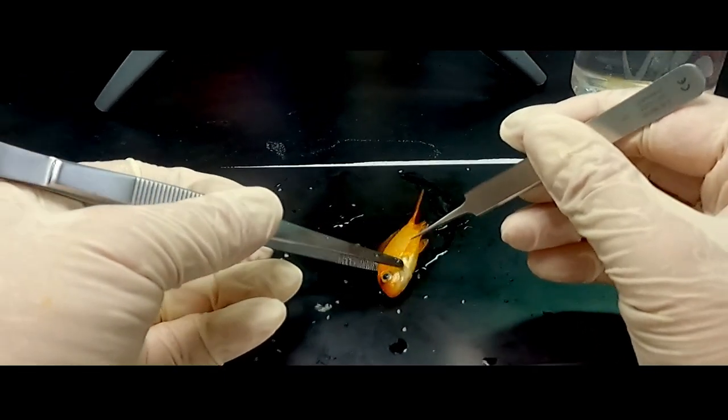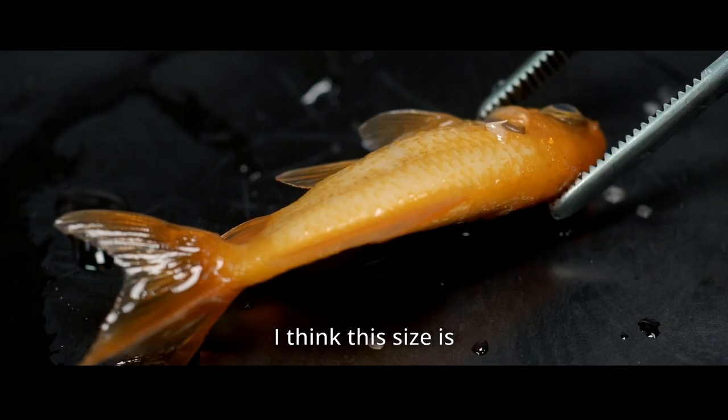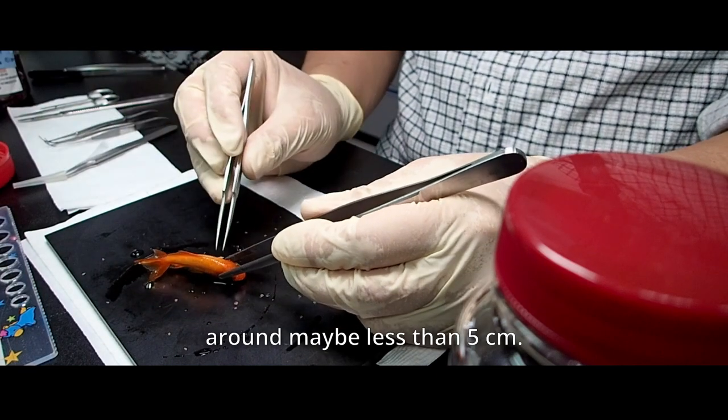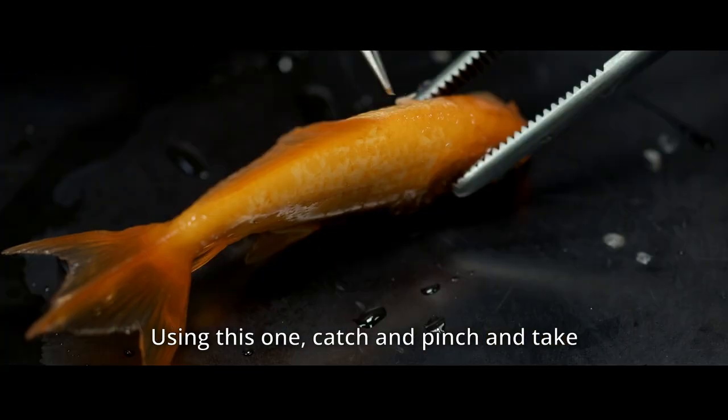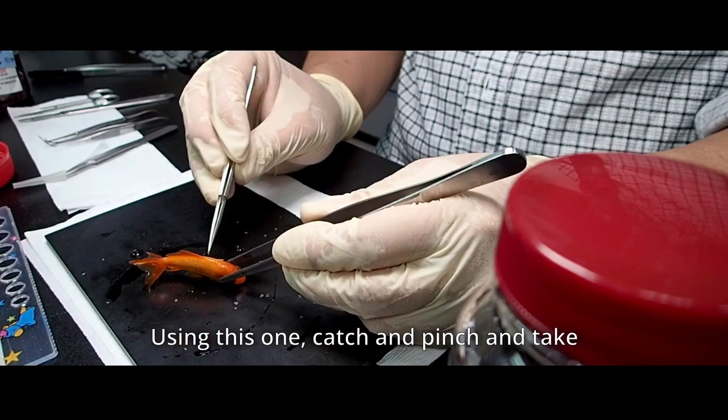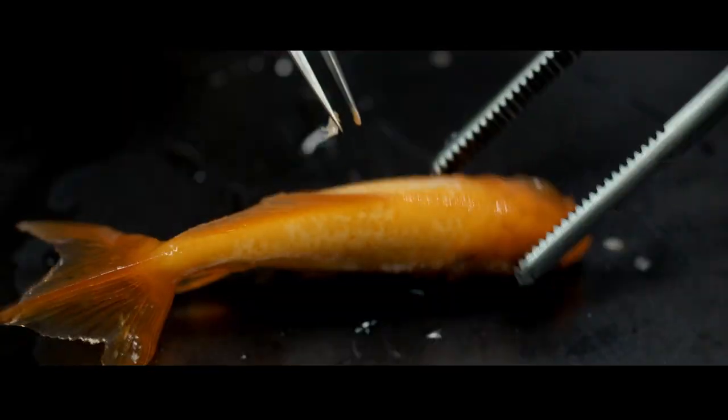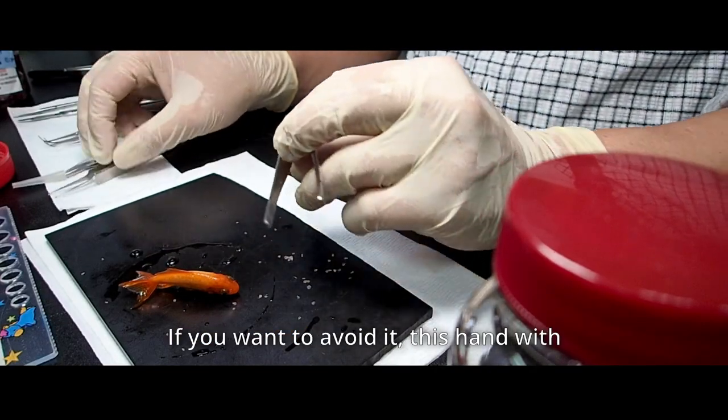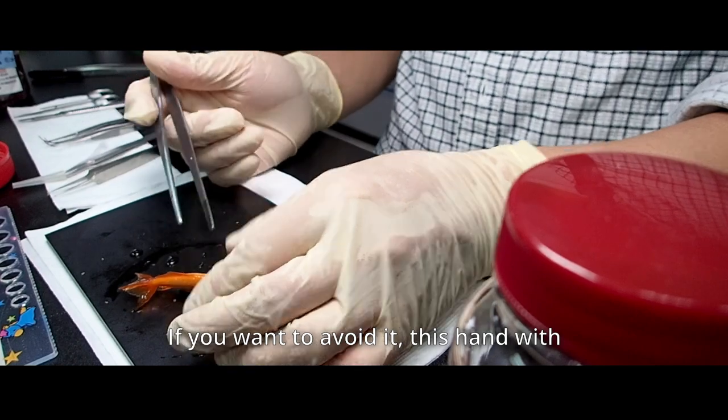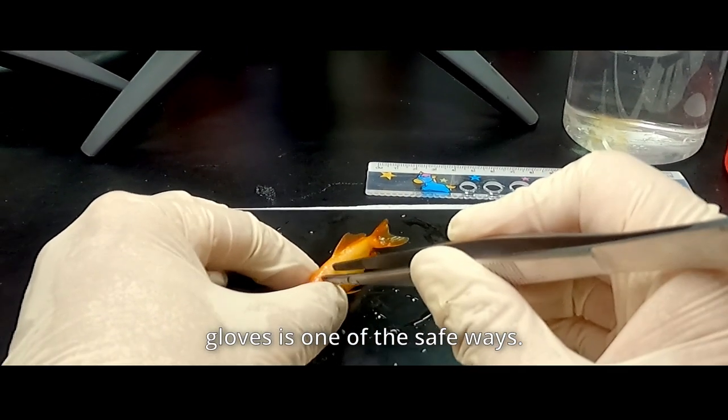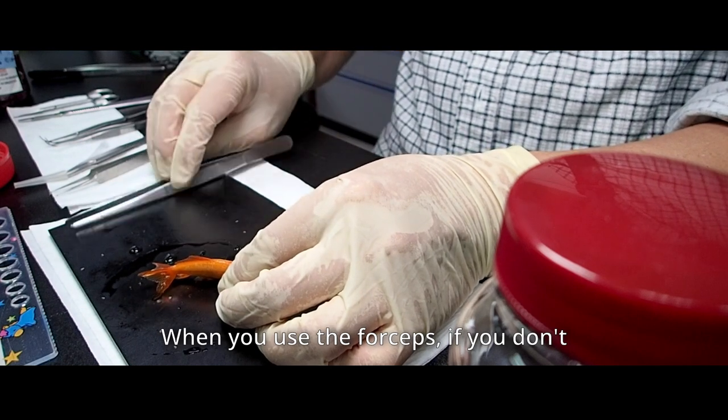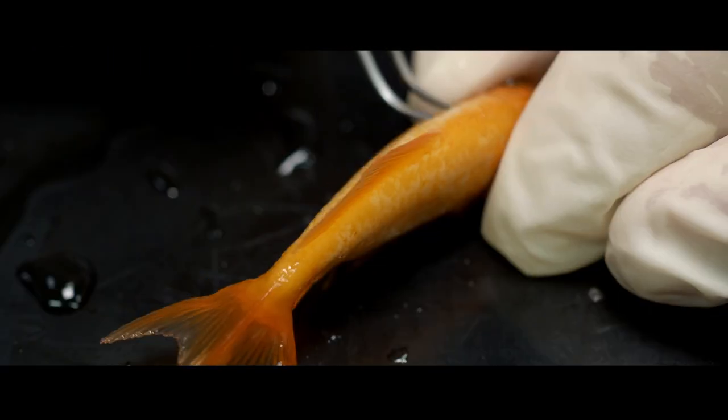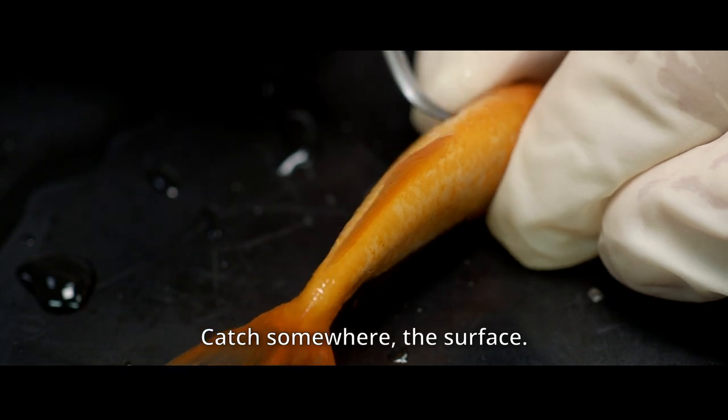I think this is the size around maybe less than five centimeters, like a tiny sample. And using this one, catch and pinch and take the surface of the skin is one of the ways. And if you use this one, really strongly pinch and sometimes crush the bone. And if you want to avoid it, this hand with gloves is one of the safe ways. And when you use the forceps, like this, or if you don't want to damage, like this, just you use this and catch the surface, somewhere, the surface.